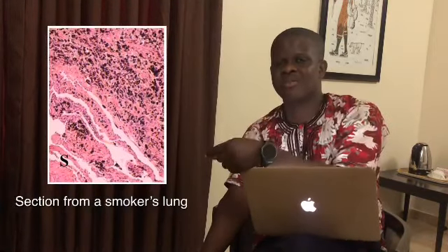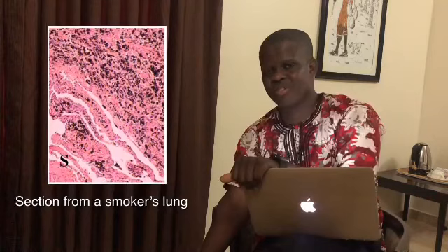So even when you know how the lung cells look, and there is something wrong, an abnormal cell of the lung may actually look like a normal cell from another part of the respiratory tract. So that is something you should always have at the back of your mind: cells don't look alike, and so you should be precise and absolutely sure about where you are collecting the sample from, and how the individual cells look in normal state and in disease state.